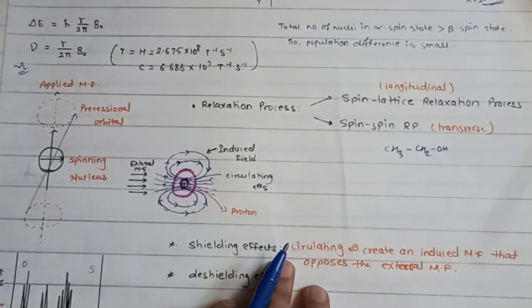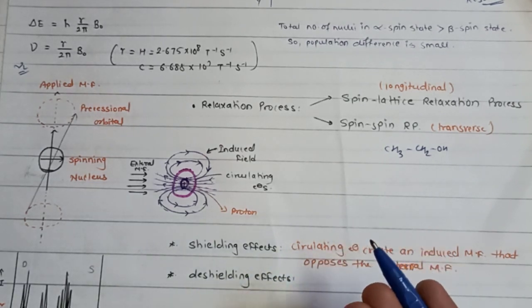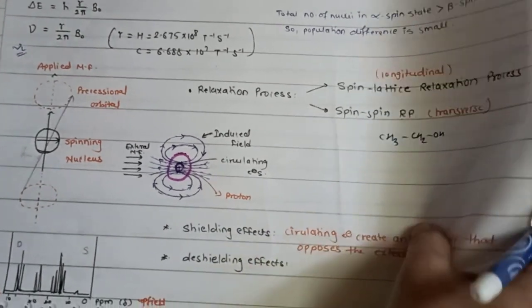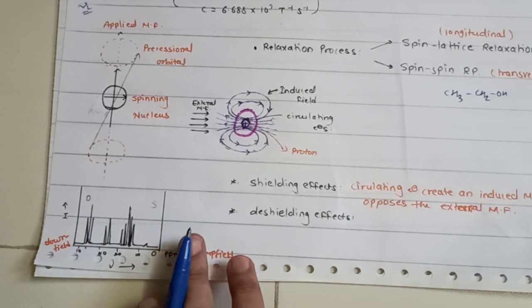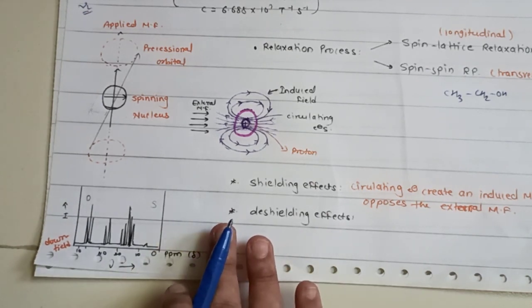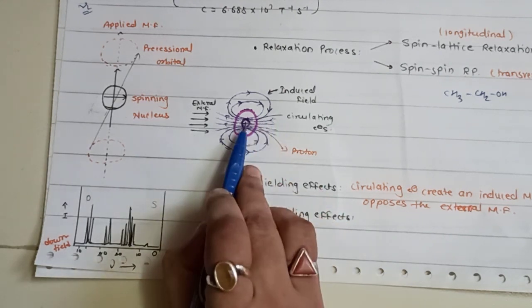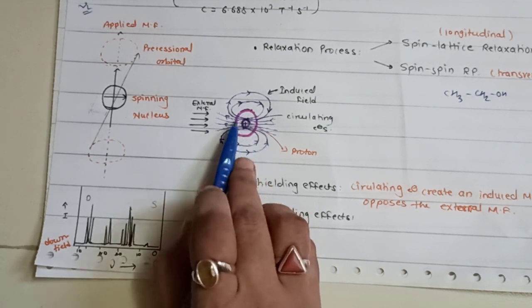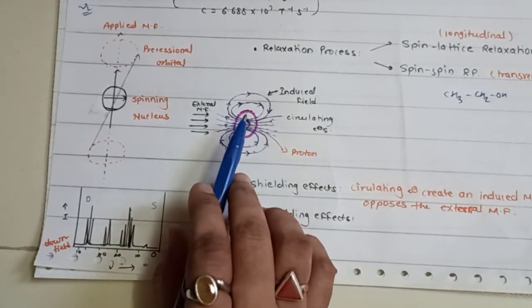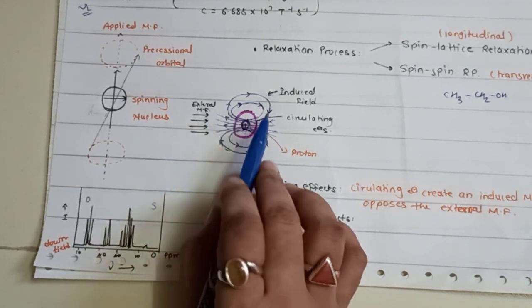So at a particular magnetic field strength we might expect that all the nuclei will absorb the same frequency. Okay, we are considering that radio frequency radiation, but this is actually not true because the nuclei are going to be surrounded by the electrons. बराबर, because यहाँ पे मैंने क्या बोला था जो भी हम लोग यहाँ पे न्यूक्लिया का, they are going to be surrounded by what, over here, nucleus electrons. Now they are going to be completely shielded, यहाँ पे वो shield करे because of this electron.